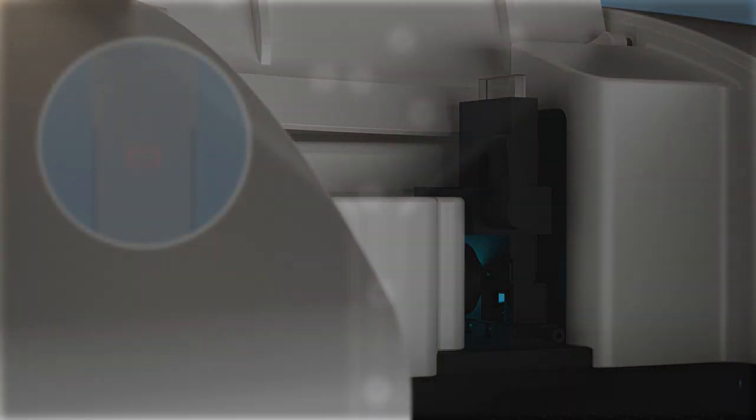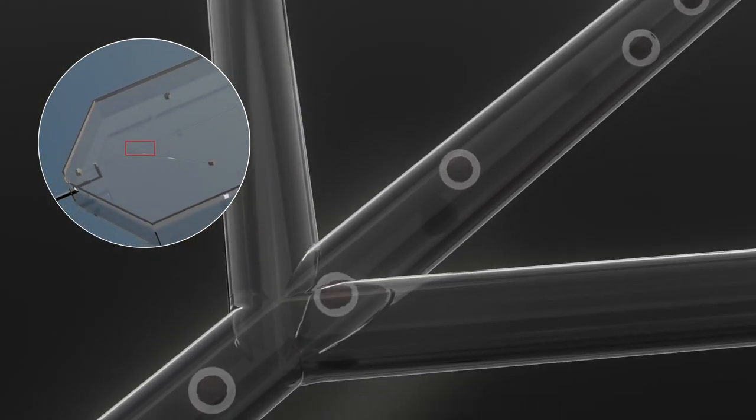Cell cartridge is pressurized with less than 2 psi, causing cells to travel down the center microfluidic channel with sheath entering from both sides.